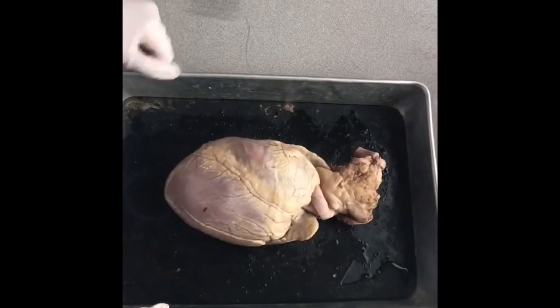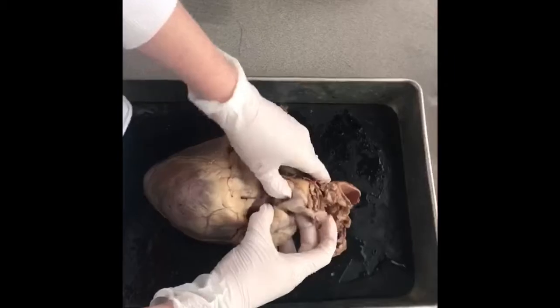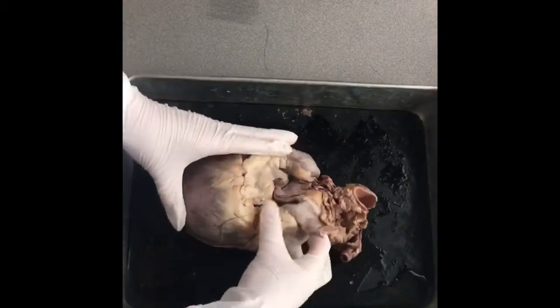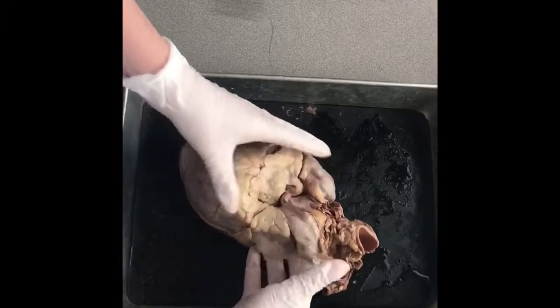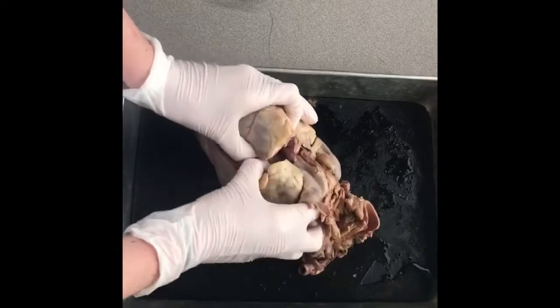This is the front of the heart. We know because the auricles are facing frontwards. We turn it around and we can see the blood enters the heart through two large veins, the inferior and superior vena cava. It empties oxygen-poor blood from the body into the right atrium of the heart.